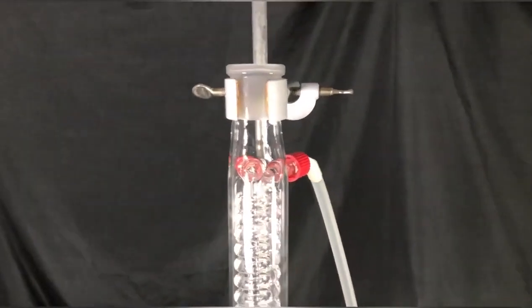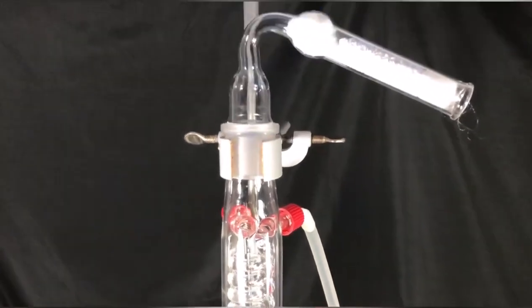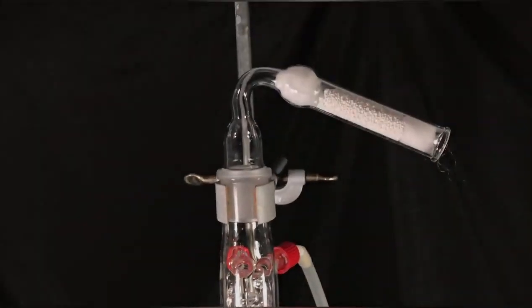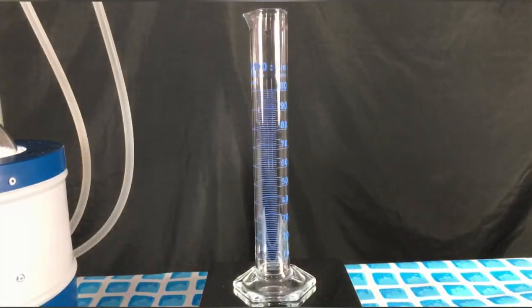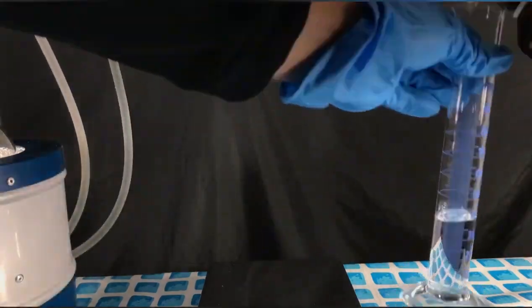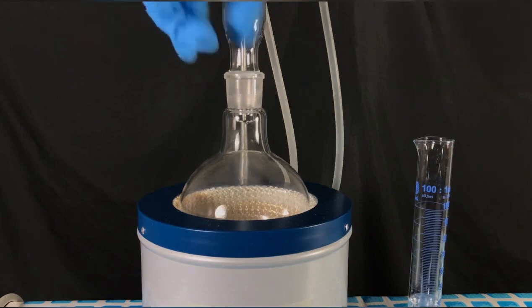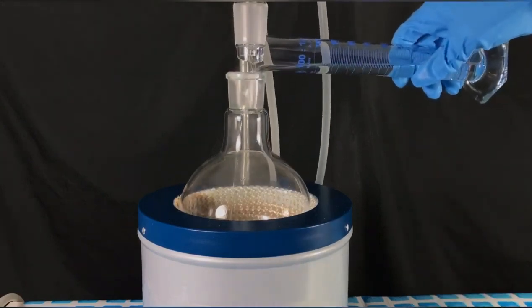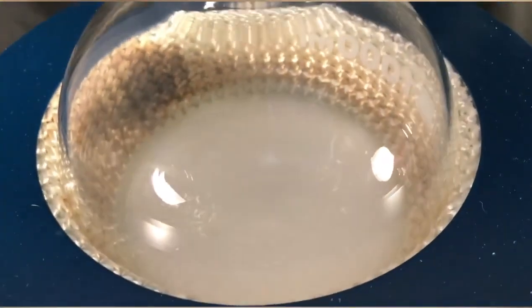When the sodium had dissolved, the gas outlet tube was switched out for a drying tube. The drying tube is filled with calcium chloride to prevent any water from entering the apparatus. Any water present will decrease the yield, therefore the ethanol also has to be as dry as possible. 40 grams of diethyl malonate were weighed out. The reflux condenser was then removed and the diethyl malonate was added to the round bottom flask. After the addition, this white solid chunk was formed.